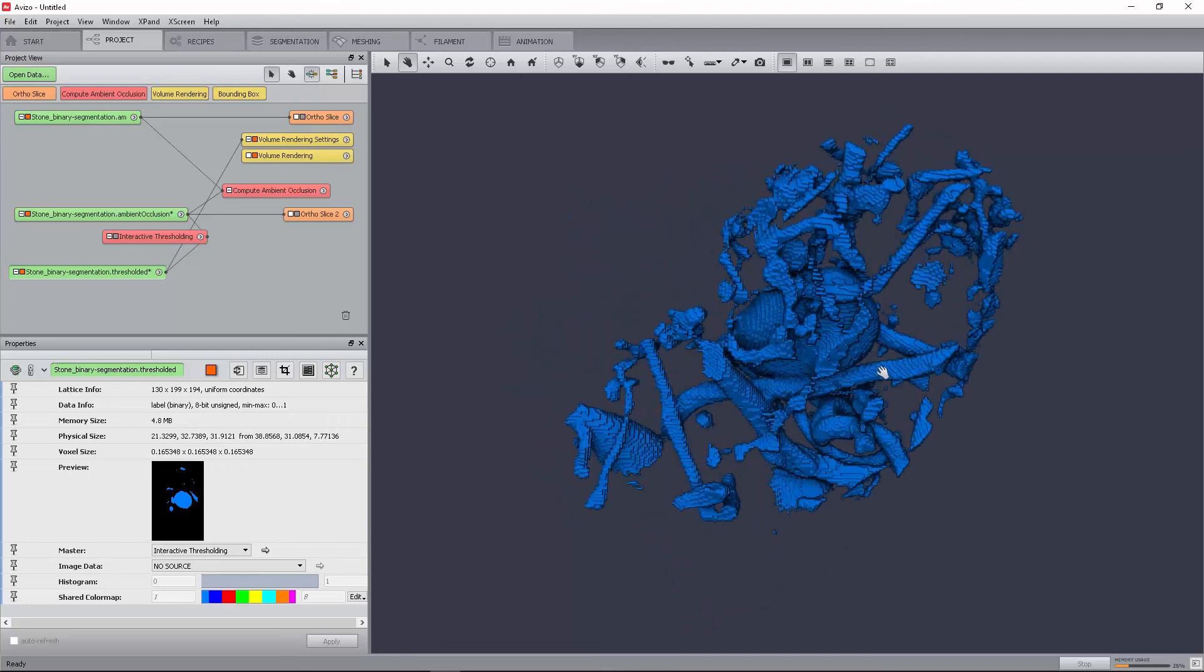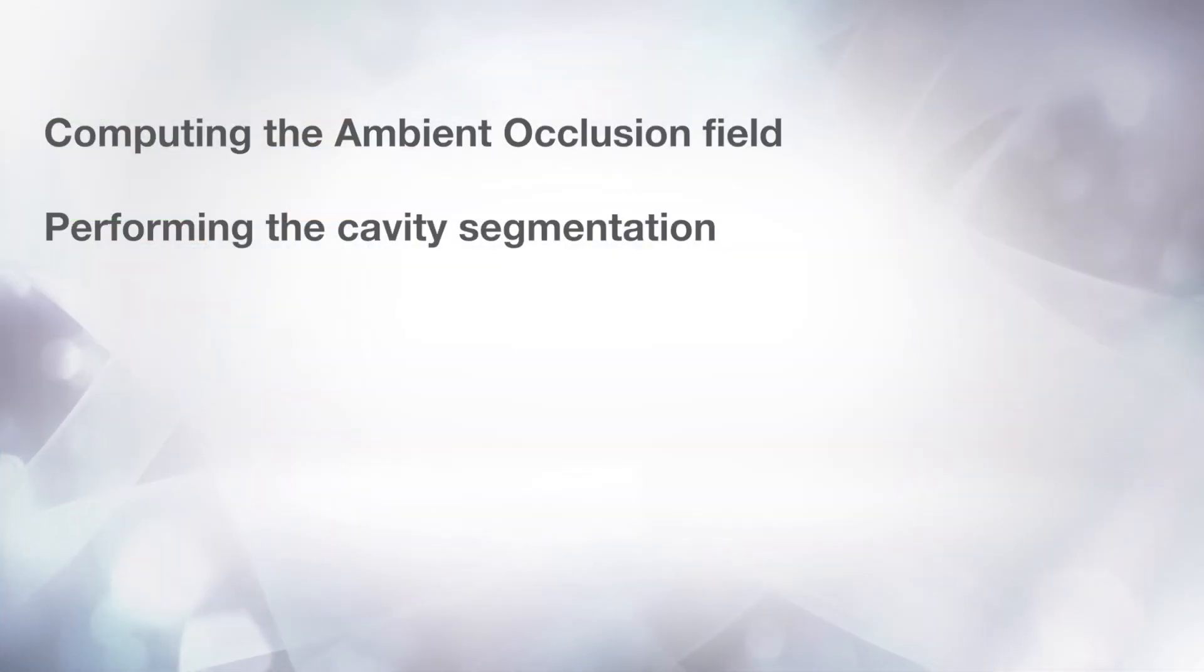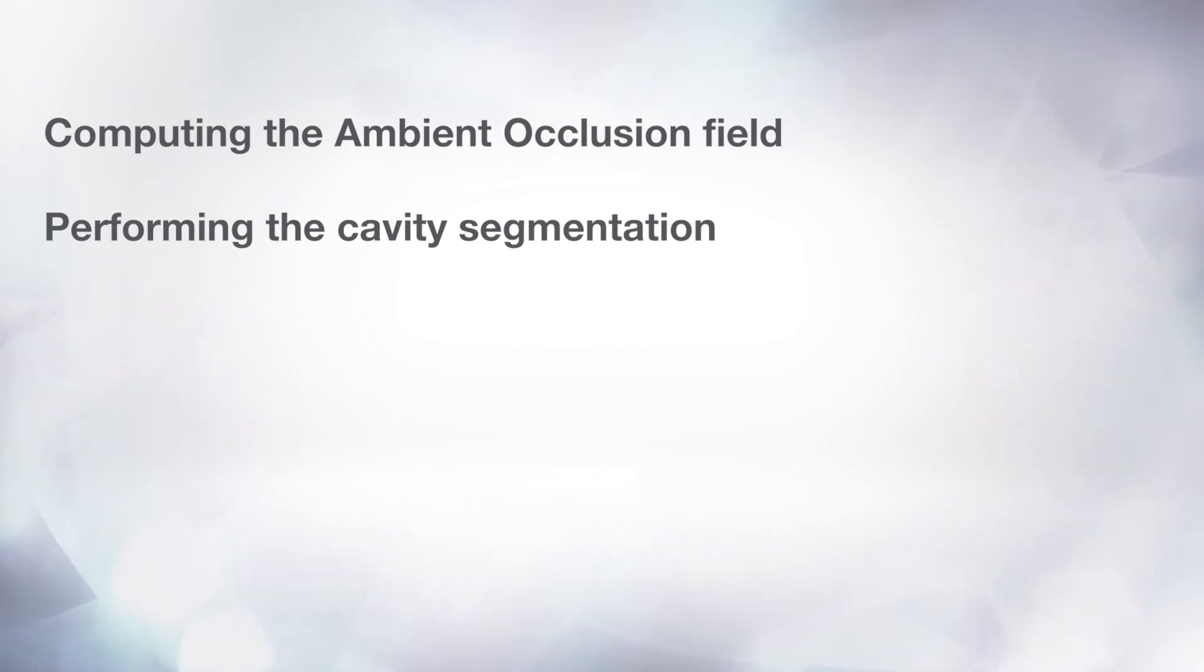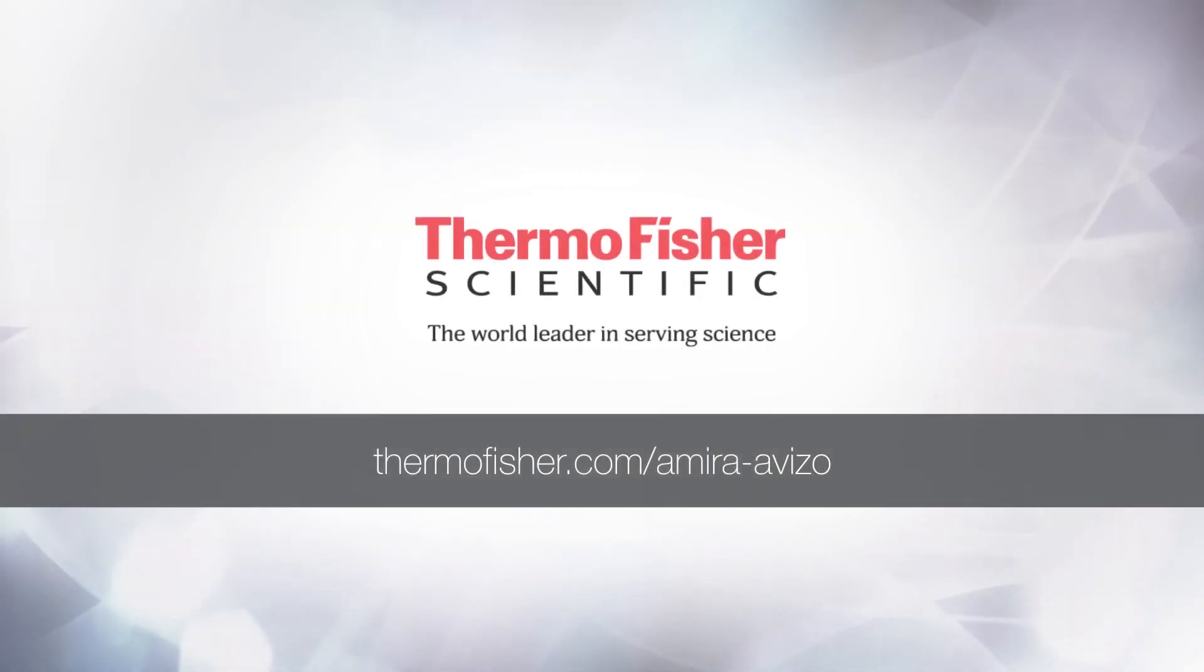You can do post-processing in a segmentation workroom. One way to do so is to use the magic wand tool. For more details, please refer to the dedicated documentation and tutorials. As a summary, in this lesson, you should have learned how to compute the ambient occlusion field and then use it to segment the cavity space.